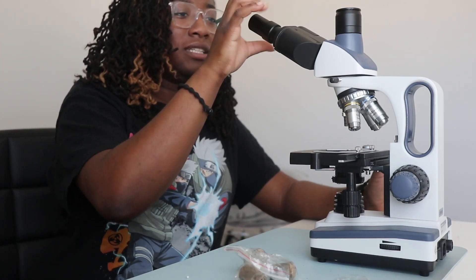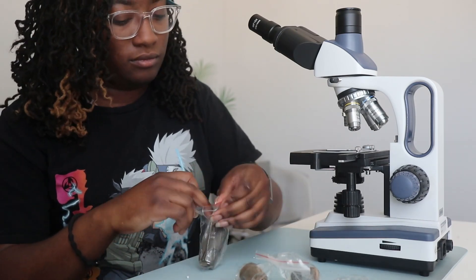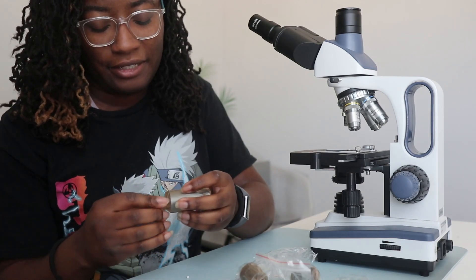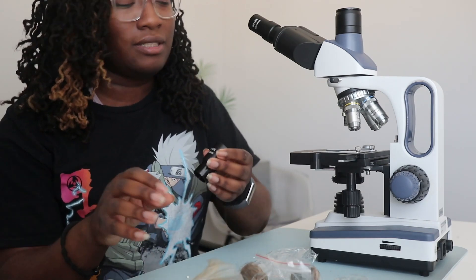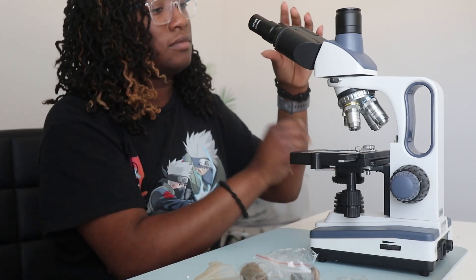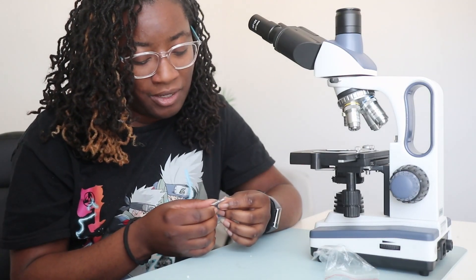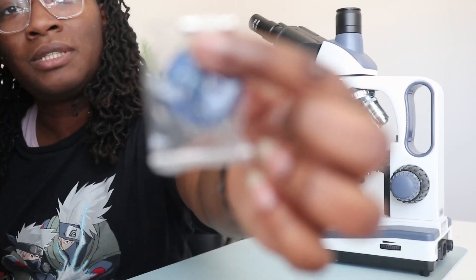Just popping it in like that. So that's one. I assume the other ones are 25x, which I don't necessarily need that much magnification, so I don't know if I'm really going to use them, but we will see. There's also a filter. For light microscopy, most times we're already using proper lighting, so we don't necessarily need filters to cancel out light or anything. It did come with a replacement bulb, so hopefully I don't have to use that either. And here's my power cord.